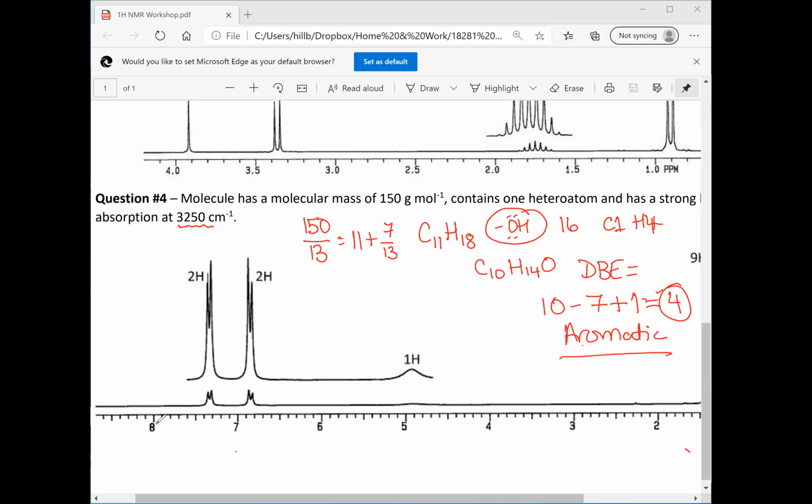Usually, depending upon the substituents, the low end will be around 6.5 and the high end will be 8. If you get some really electron withdrawing groups on there, you can pull it a bit further. But these two protons here are right in the aromatic region. So that's a real good little check mark.